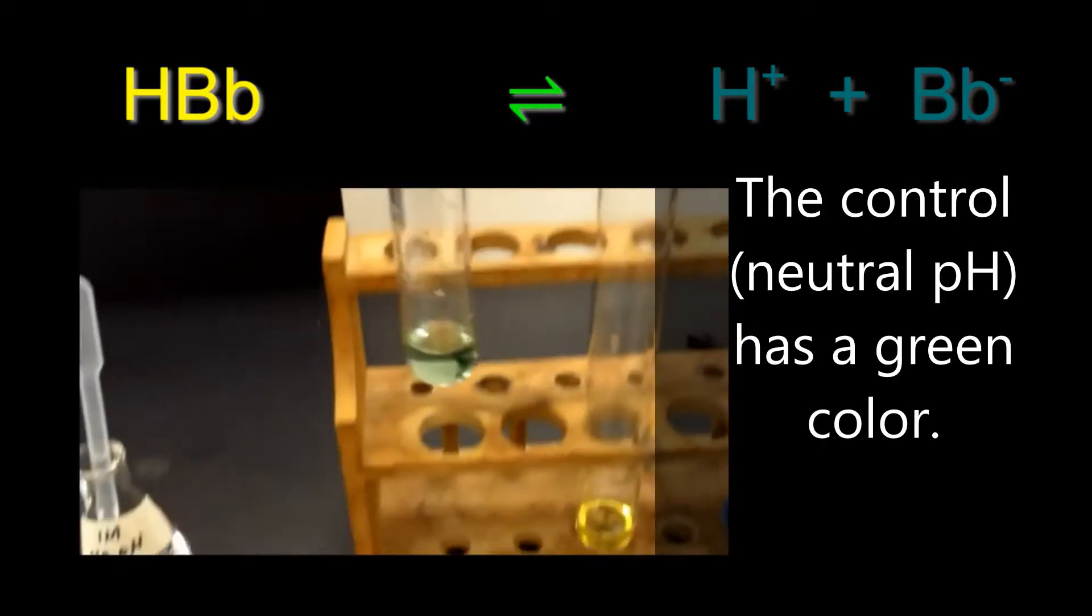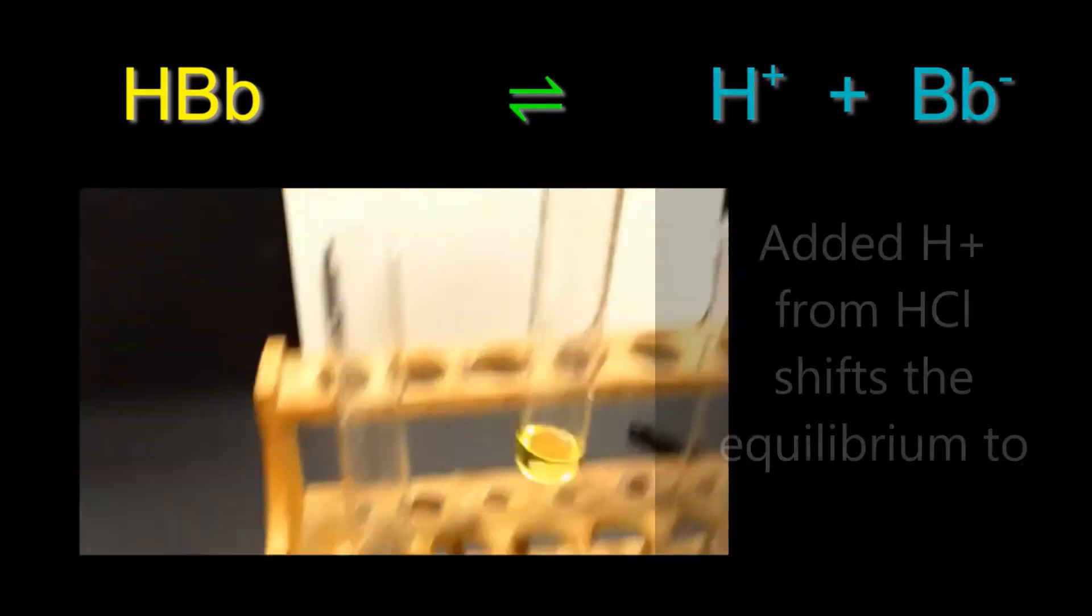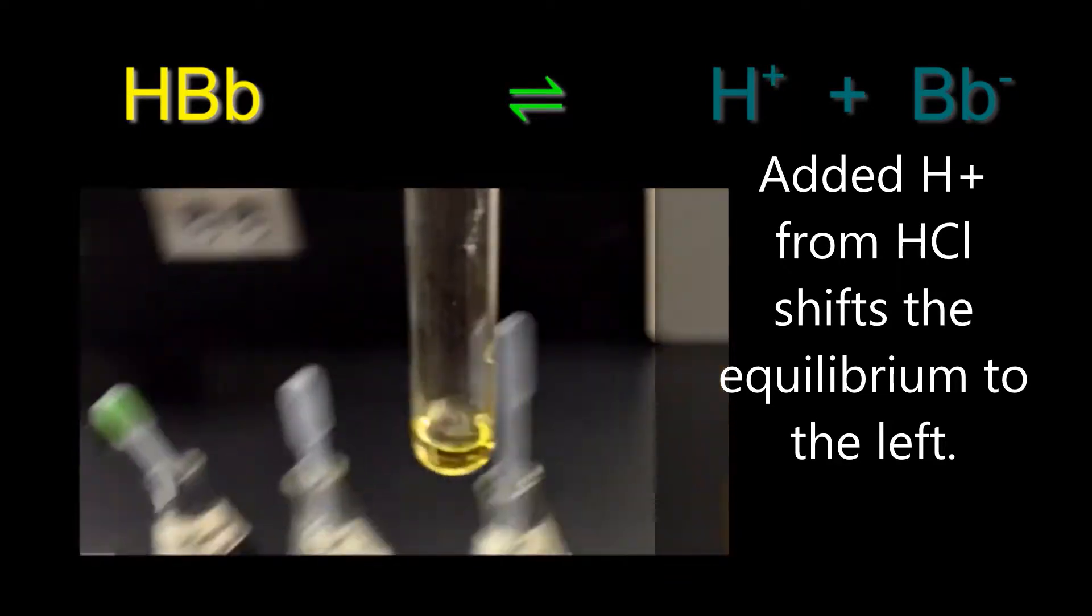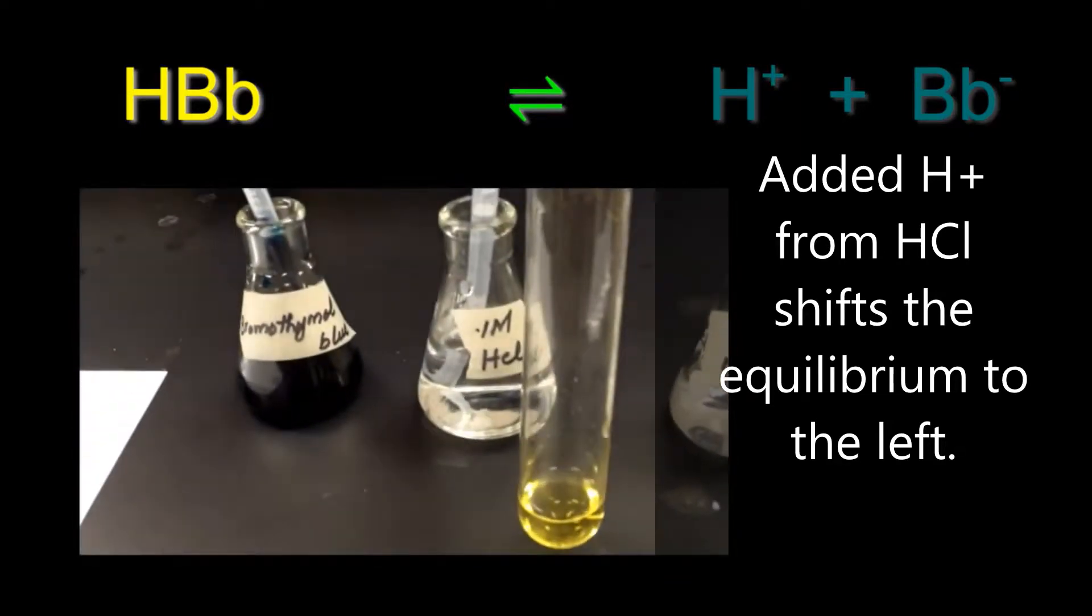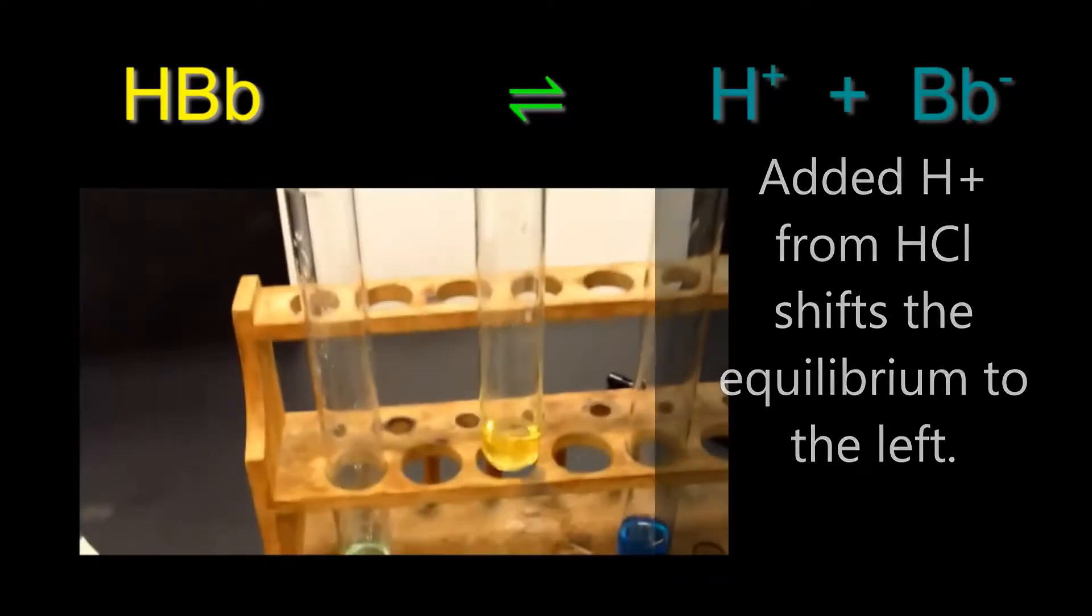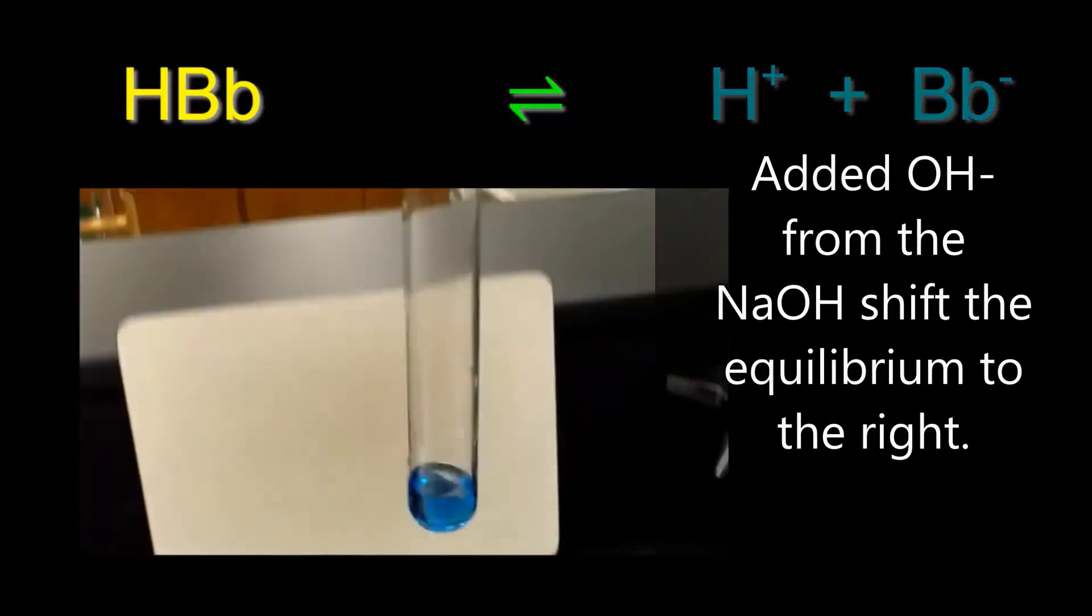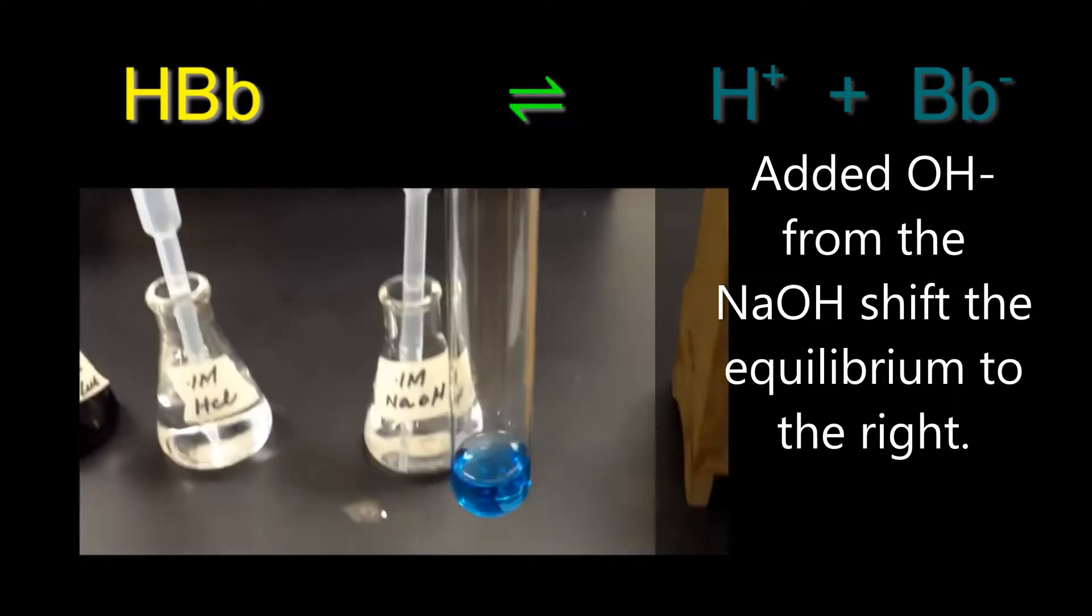The control test tube that has only water has a neutral pH and a green color. The second tube has turned yellow because the equilibrium was shifted to the left by the addition of the hydrochloric acid. The third test tube has turned blue because the addition of the hydroxide ion shifts the equilibrium to the right.